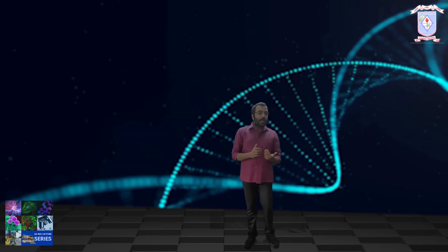DAPI is commonly used as a nuclear counterstain in fluorescence microscopy, flow cytometry, and chromosome staining. Because of its high affinity for DNA, it is frequently used for counting cells, measuring apoptosis, sorting cells based on DNA content, and as a nuclear segmentation tool in high-content imaging analysis.